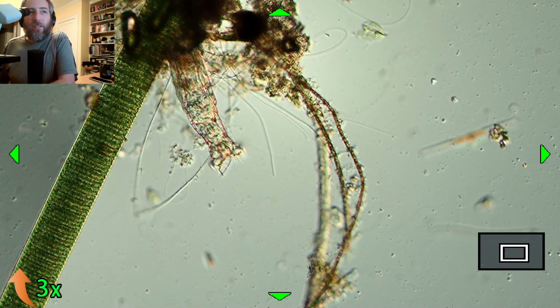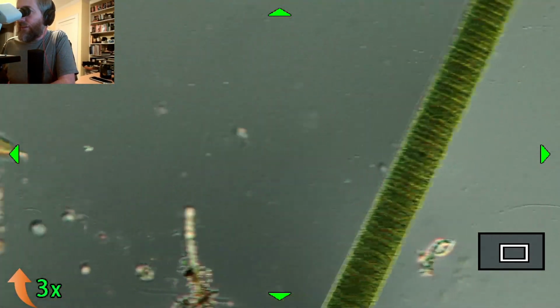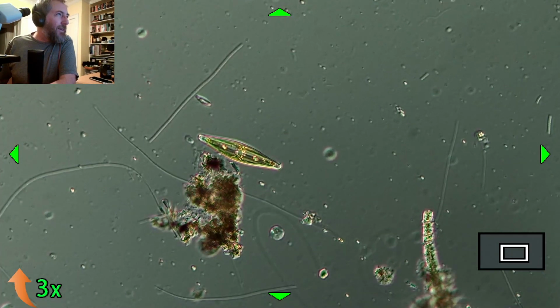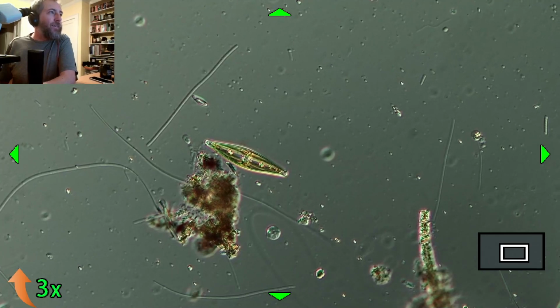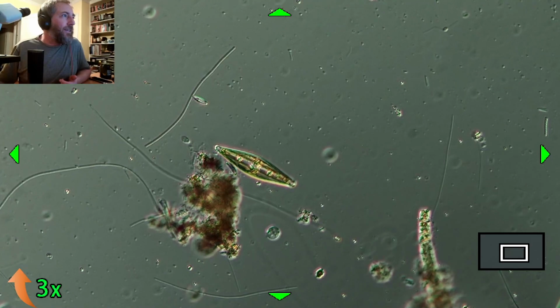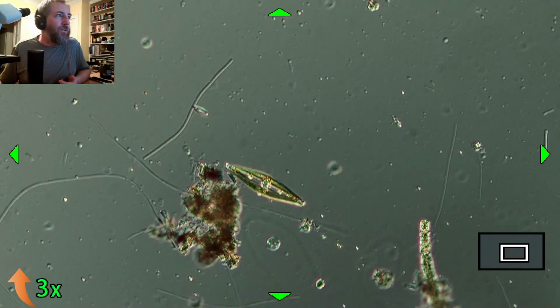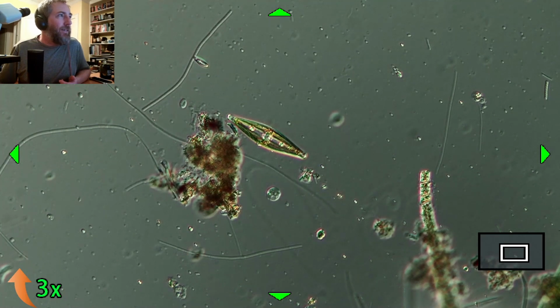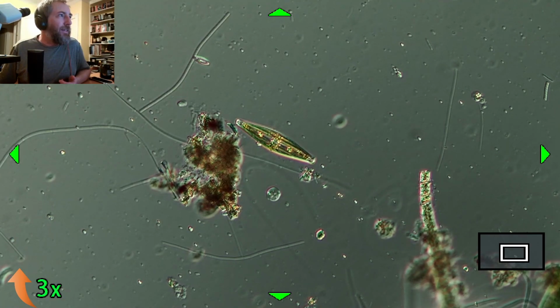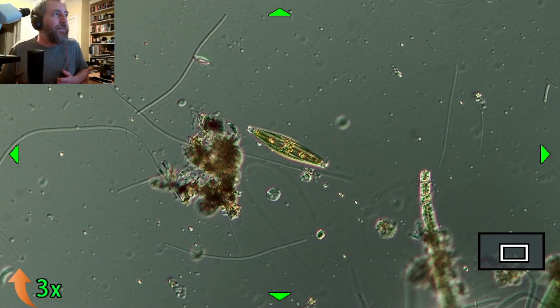Zulu said that diatom is thick. There is a diatom. That's where I get my name. I study diatoms, and there is a diatom here. Diatoms are a type of golden brown algae that are, some of them are mobile, sort of like the other ones, only these don't have cilia. They move around a little bit more like a snail or a slug does. They drag themselves along by a little slit in the valve.